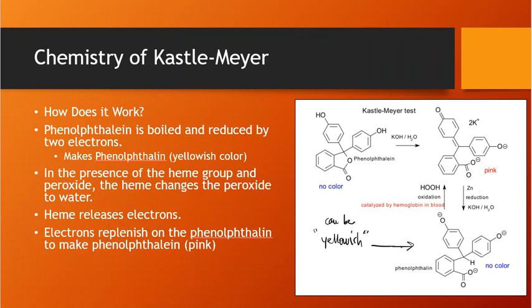Why does this thing work the way that it does? Well, what you're seeing here is phenolphthalein, and here's the molecule of phenolphthalein, right? And in our recipe, we used NaOH, but you could also use KOH. It's the same thing. It's still a base. And that base is going to add to phenolphthalein.